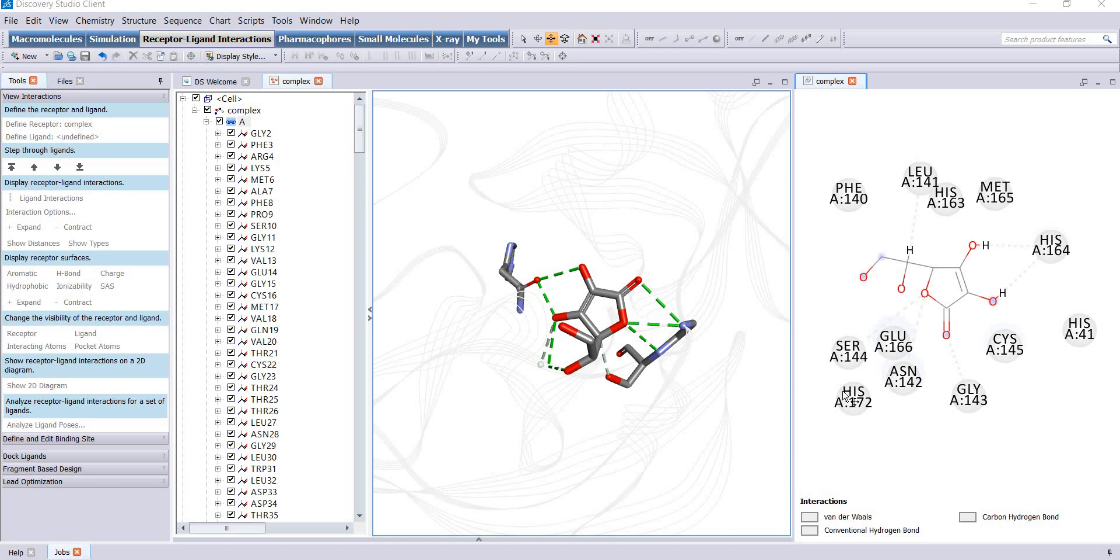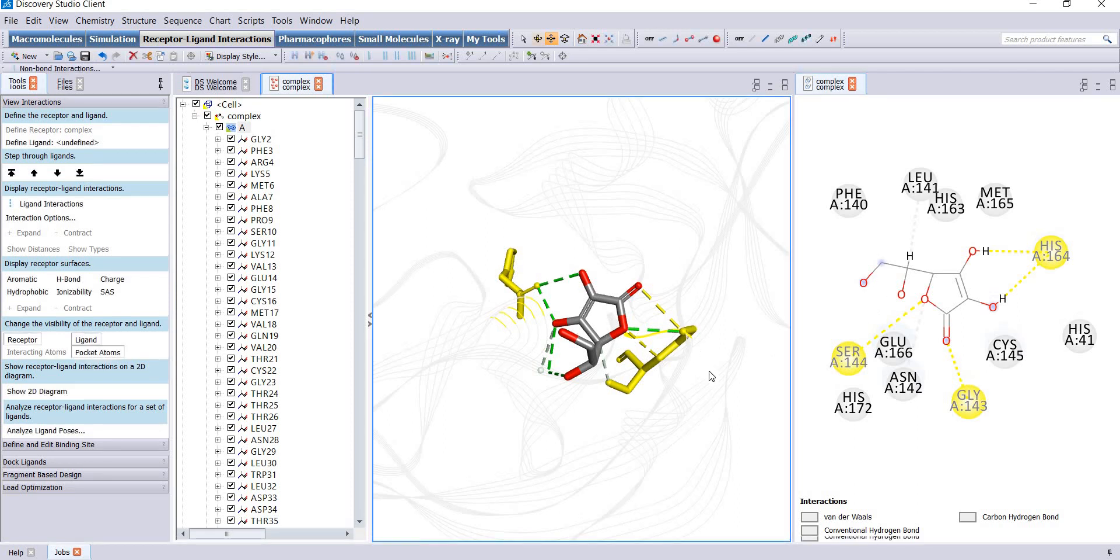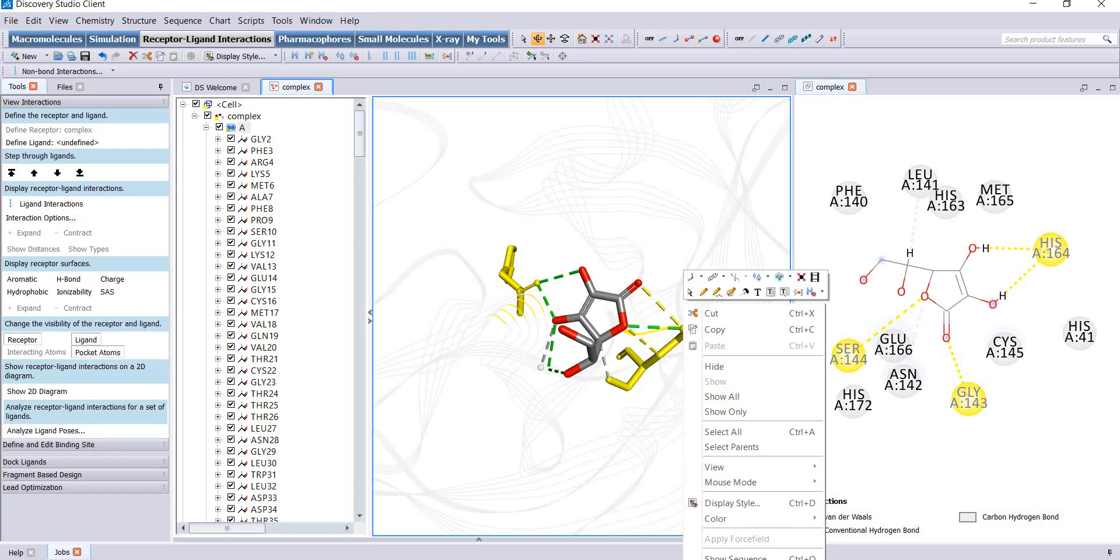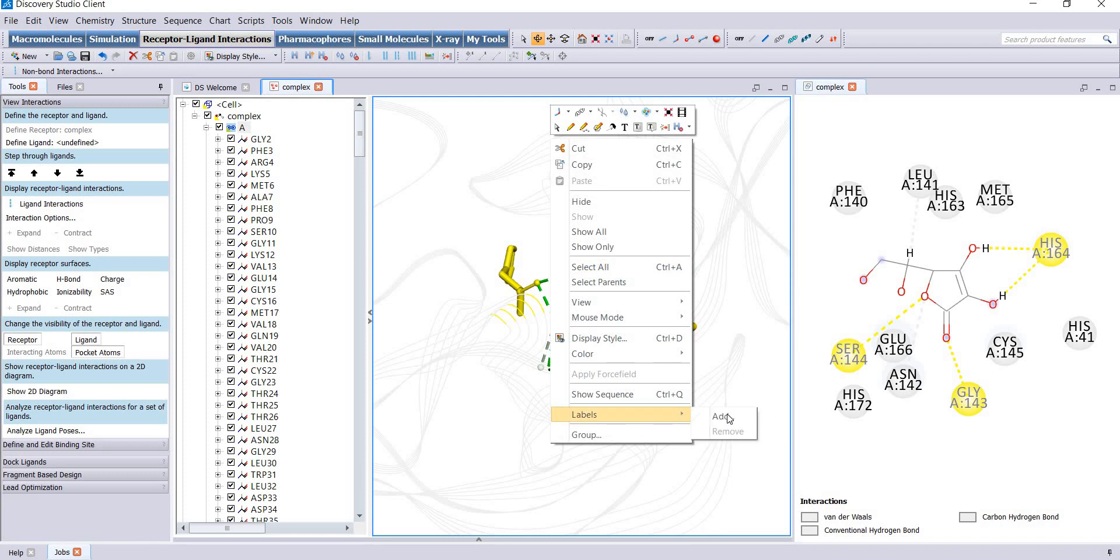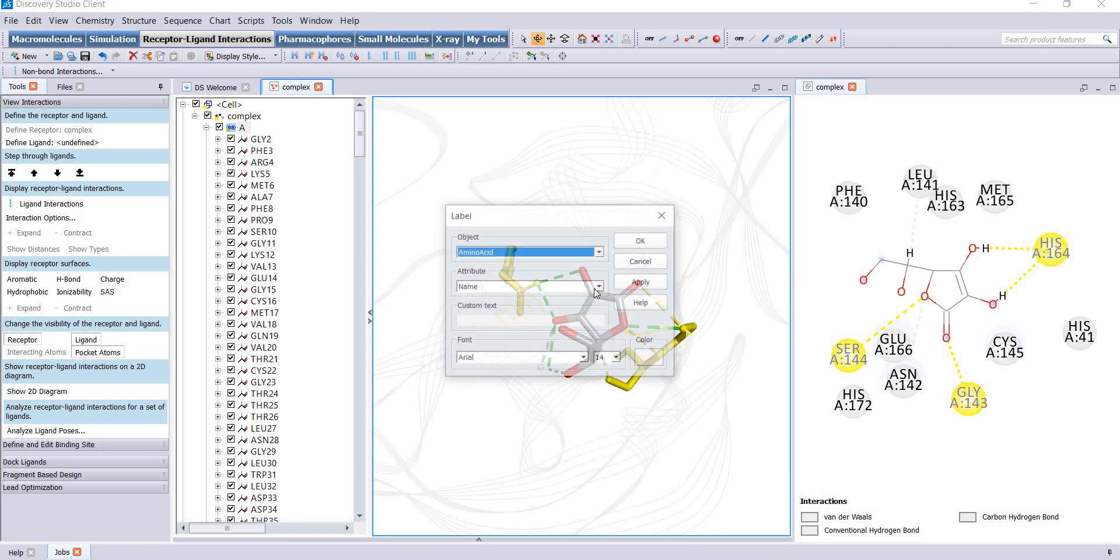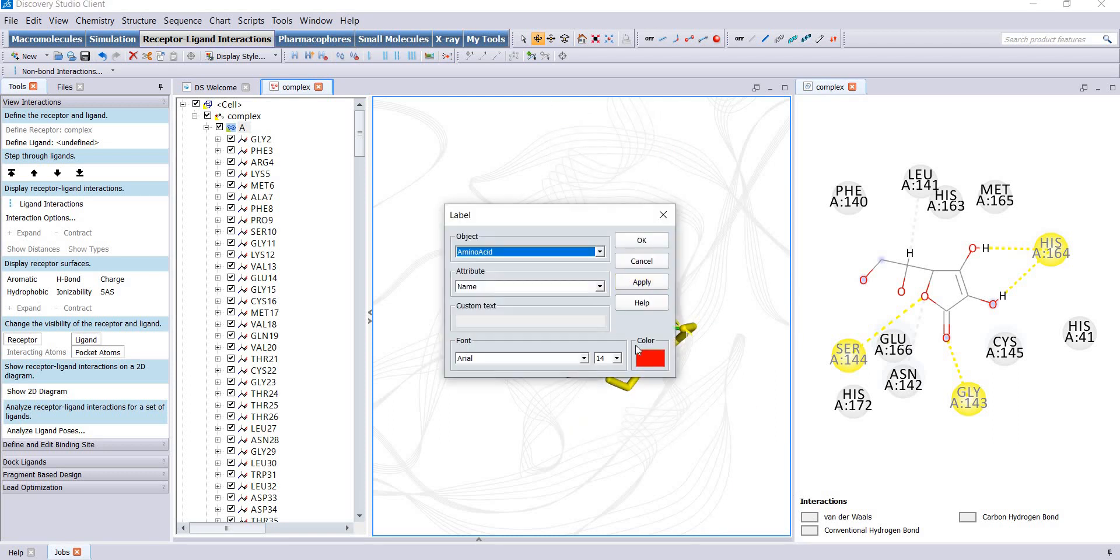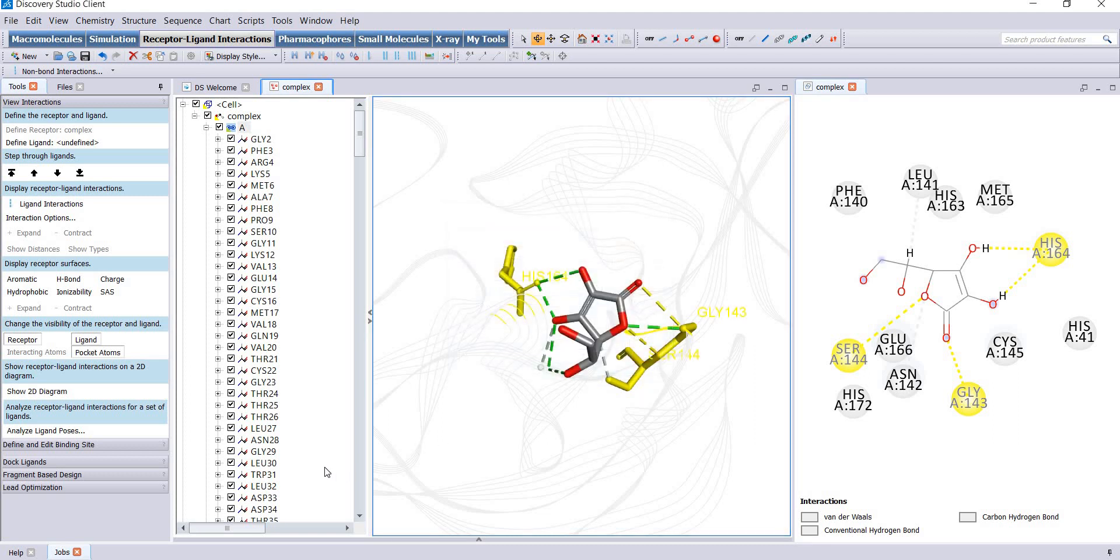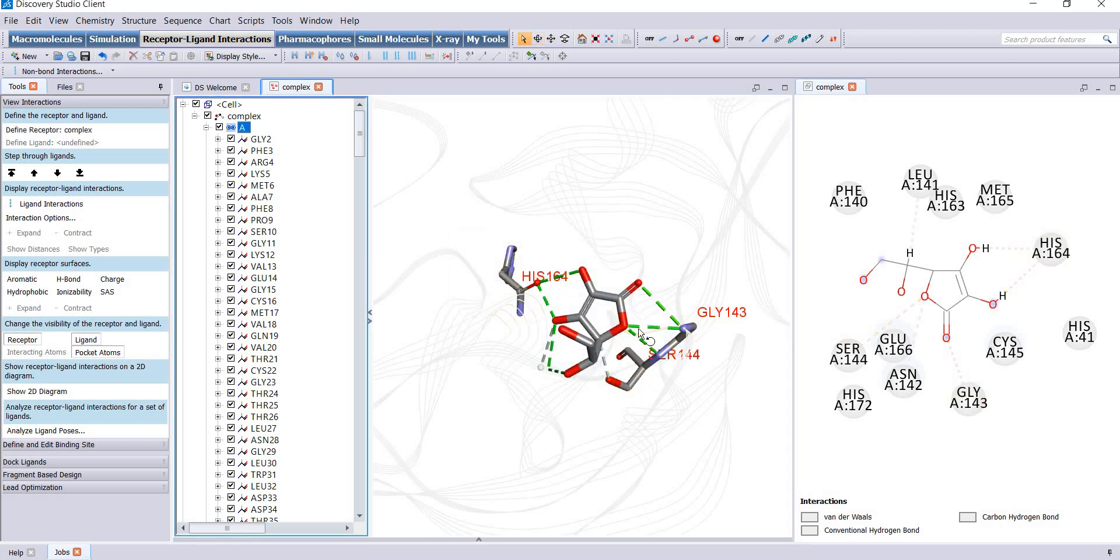I will remove those labels and I am selecting only the residues which are forming hydrogen bonds once again. Right click, labels, add, red size, and okay. Now you can see the amino acids are labeled properly. You can save this pose and insert it into your practical files.